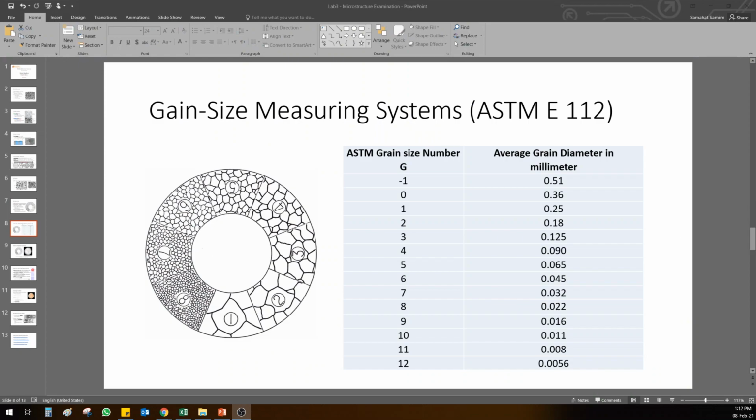Okay, here is some important information before going into the calculation of grain size. It is something which confuses students a lot. The grain size number does not mean this is the diameter of your grain. We use this table to find out the grain diameter according to the grain size number. You can see the grain size number 1 is bigger grains. The grain size number 2 becomes smaller as you increase it. If the grain size number is 8, it means the grain size is really small.